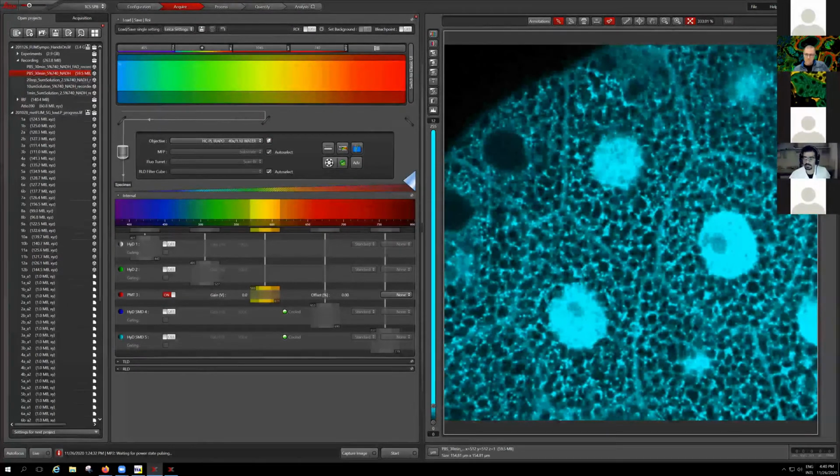And okay, the IRF measurements, as Stefanie Kamp-Peterson mentioned in her workshop, they do that every single time that they want to do a measurement. I think every day, so that you should do that. The point here is that it is necessary because you want to do the analysis using the calculated IRF. So I would say the answer to doing it every time before the experiment depends on the use of the IRF you have.